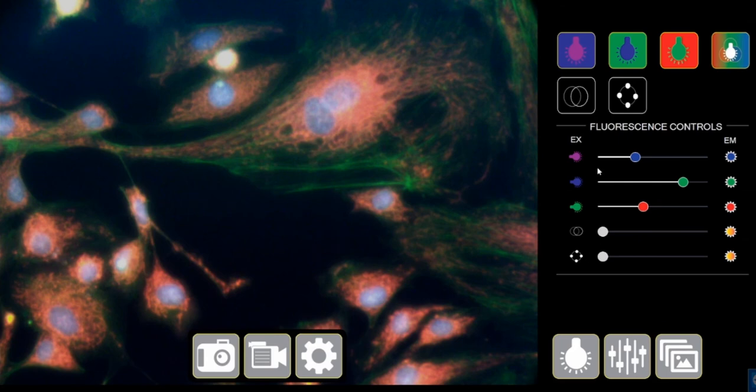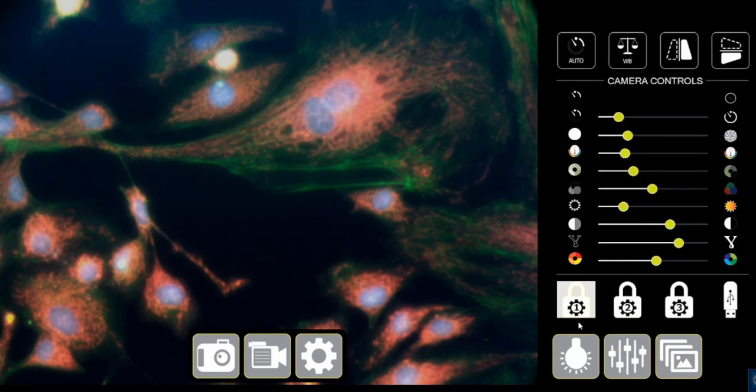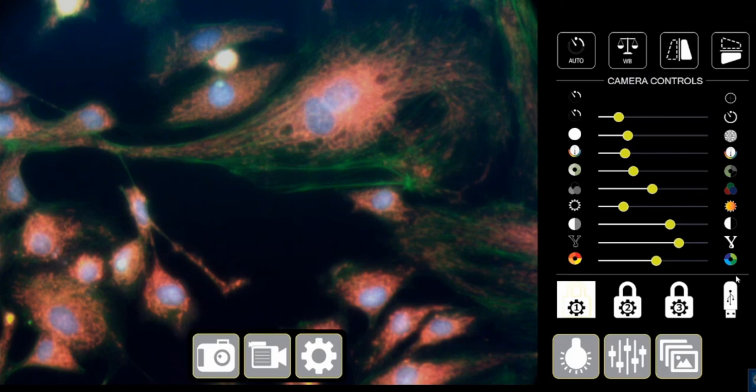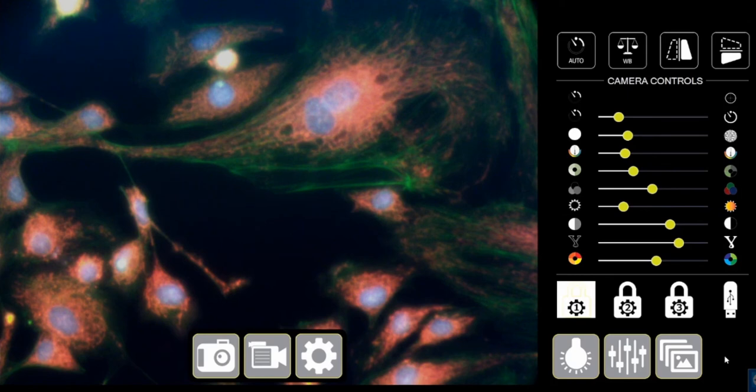Now, let's look at this other button, which is the advanced setting button. This comes in handy when you have different samples. At the bottom of this page, you can see there are three locks. So basically, this locks in these settings that I have done.